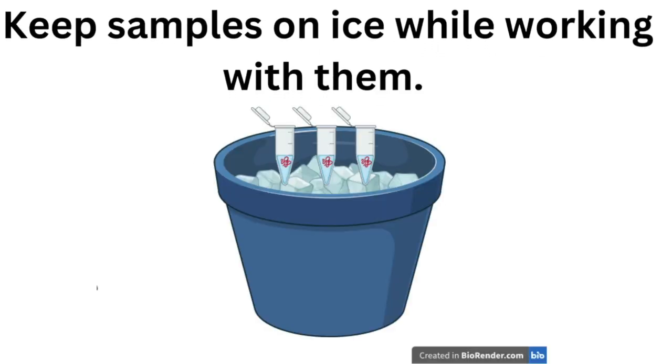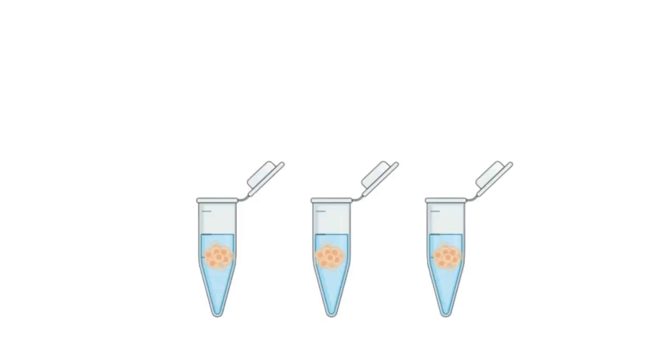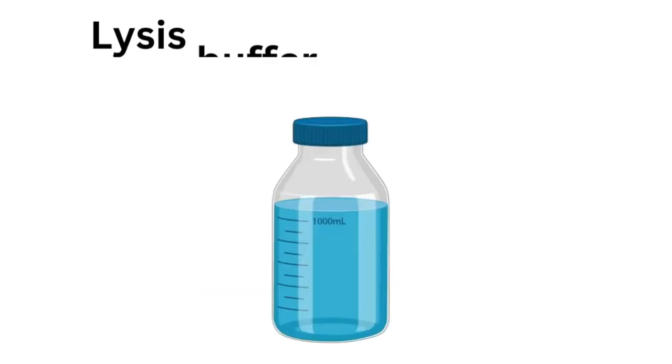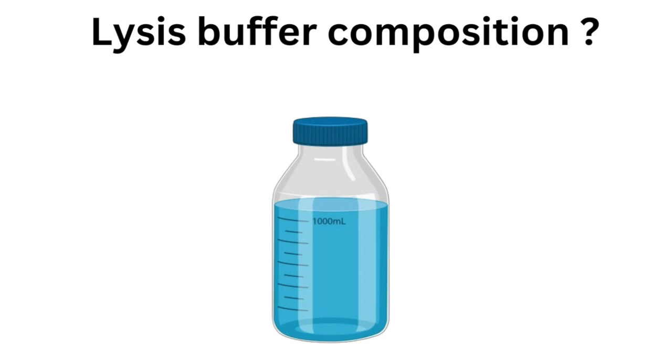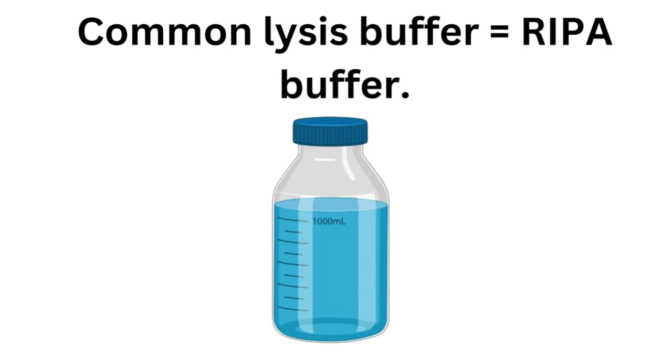Here are a few troubleshooting tips. Always keep your samples on ice. Use fresh reagents and make sure your lysis buffer is compatible with your protein of interest. If you're working with cultured cells, wash the cells twice with a buffer such as ice-cold PBS. Once you add the lysis buffer, make sure it's covering the entire cells. Your choice of lysis buffer depends on the location of the protein of interest — a membrane-bound protein requires a stronger lysis buffer than a cytoplasmic one. RIPA buffer is a standard buffer commonly used because it allows maximum yield of proteins from all cellular locations.